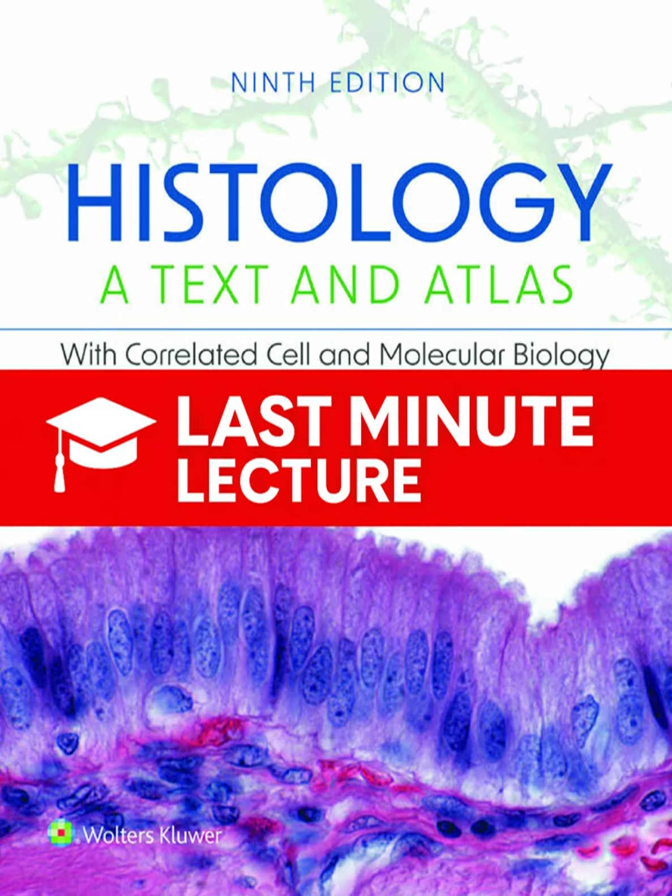And what's the go-to chemical for all of that? That would be formalin. It's a buffered 37% aqueous solution of formaldehyde. It preserves the general structure incredibly well, mostly by chemically reacting with and cross-linking proteins. It specifically targets the amino groups on proteins, right? Especially lysine residues. Exactly. And that's a really critical insight because that specific cross-linking process is so valuable for things we might want to do later.